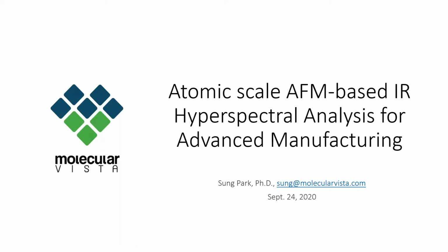Thank you, Doru, for the nice introduction and for this opportunity to speak in this webinar. The title of my talk is Atomic-scale AFM-based IR Hyperspectral Analysis for Advanced Manufacturing. Really, the atomic portion will be more limited to the vertical direction, so the height of the film, and more nanoscale in the lateral direction because we do not have true atomic resolution.